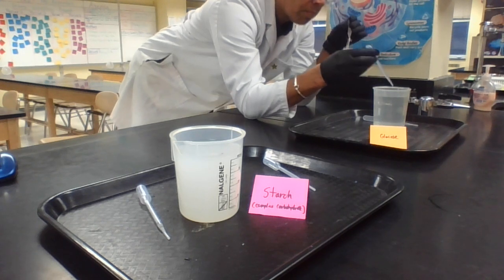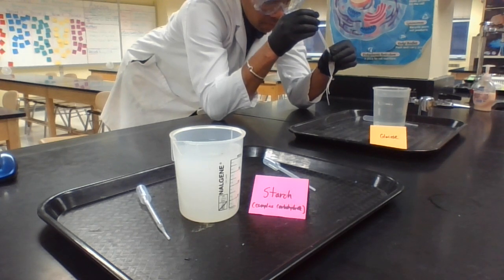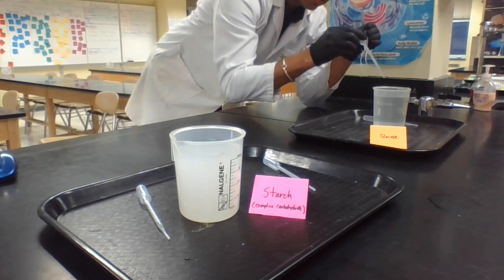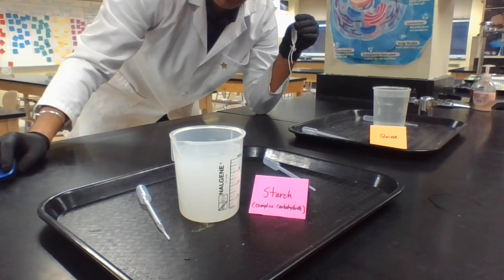And you're going to also put the other half, fill the rest of this dialysis tubing, but make sure you have enough space to be able to twist it and tie it. Okay, perfect. Squeeze the rest back in there. Then you're going to go to the sink and do something very important.